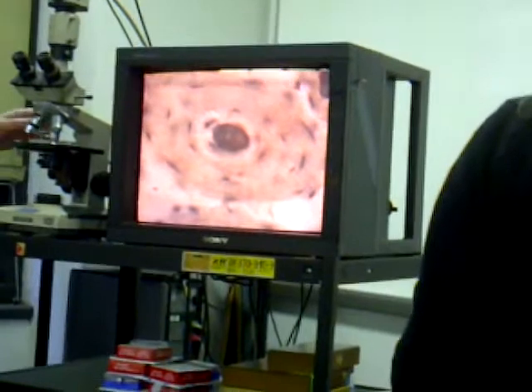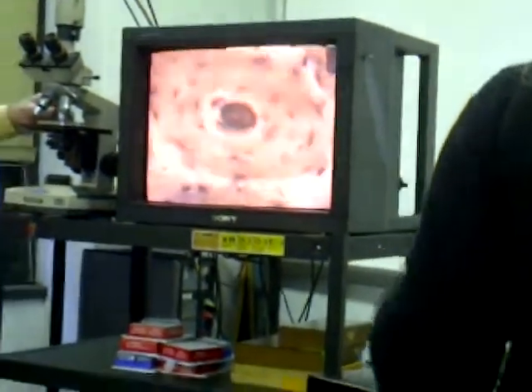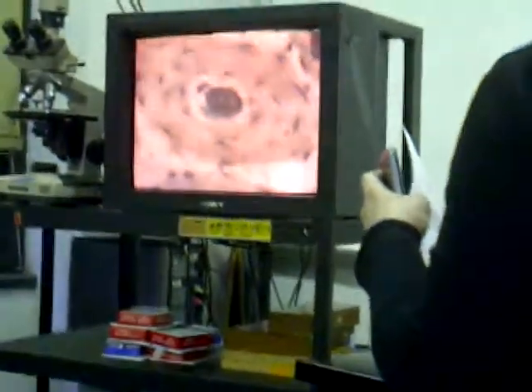Well, if you understand that, you don't have to remember that. I'm not going to ask you, are they full of bone powder? I'm just reminding you what they're full of: how the slide is made.